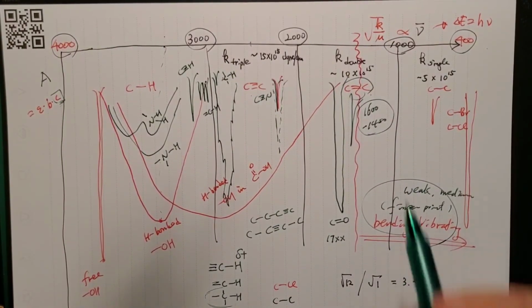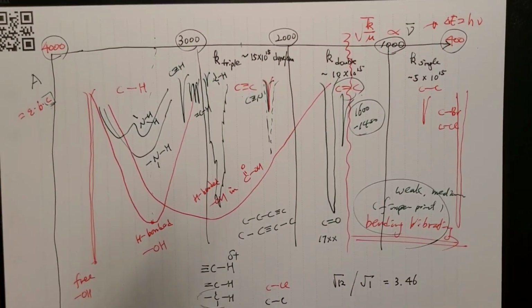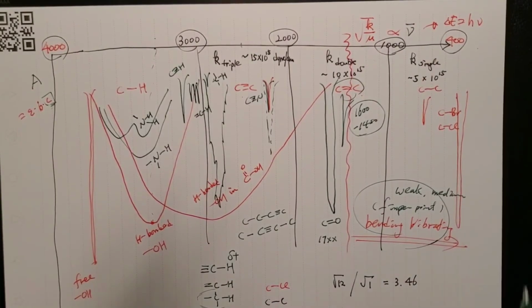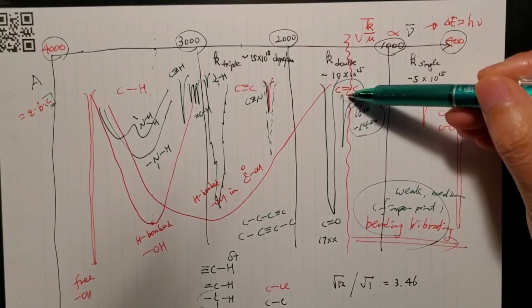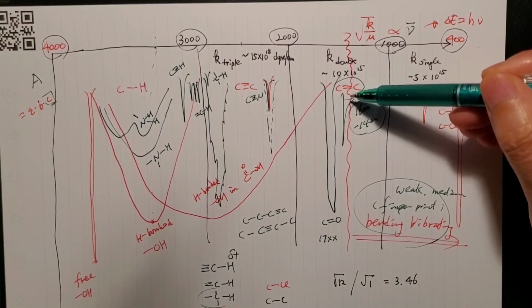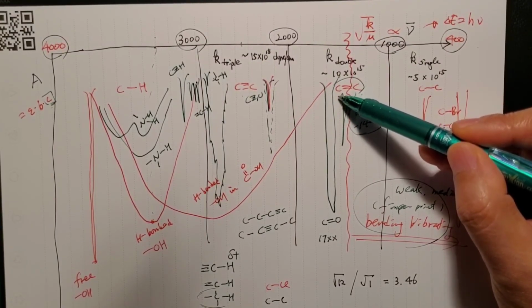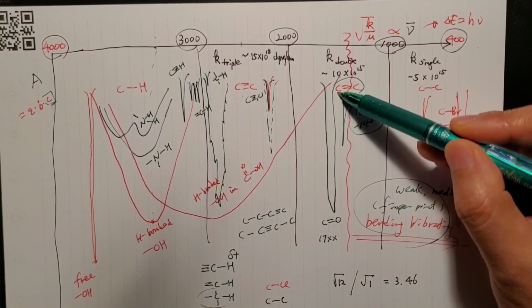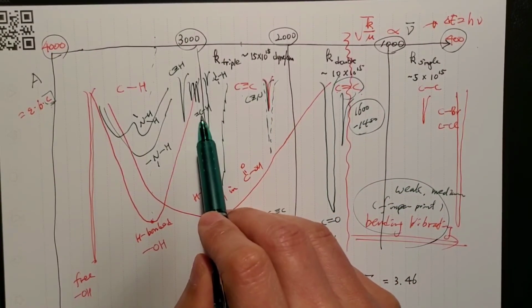Then when do you use this? This is the point where it becomes complicated for reading spectra. If you suspect the presence of a CC double bond, what do you have to check? If you have an sp2 carbon, then you may, not always, but you may have a hydrogen on it, which appears here, right? The sp2 carbon hydrogen.